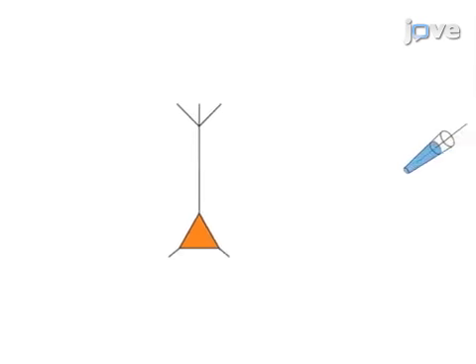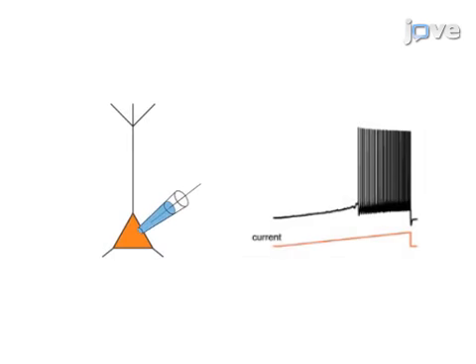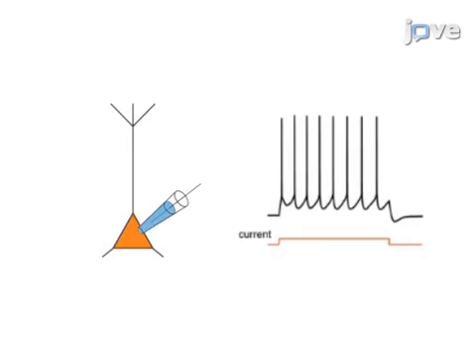As a second step, a series of automated electrophysiological protocols is applied to the recorded cell, which provides a standard characterization of the cell that will be useful for subsequent analyses and comparisons across cell types.